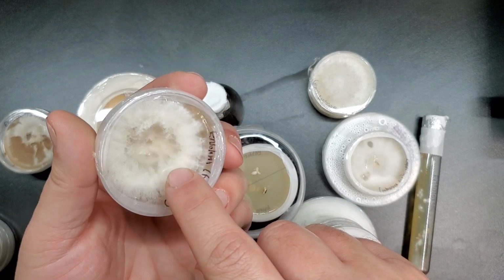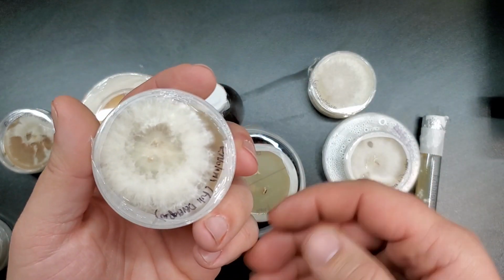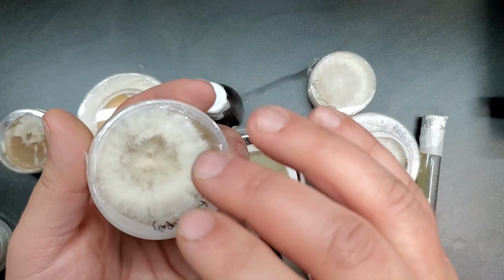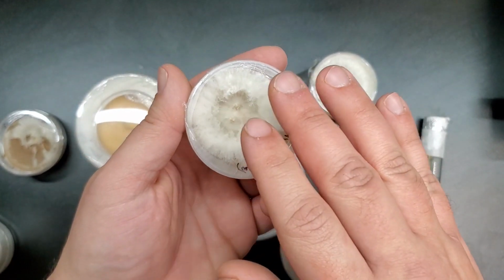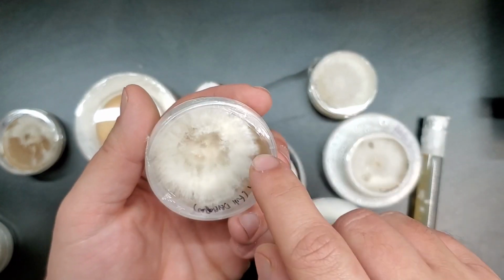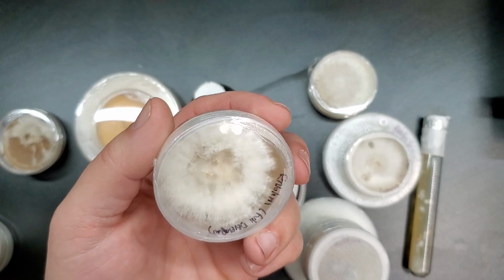And this is one of the original ones too that I inoculated with the mushroom fruit body tissue sample. Looks great. The growth is fantastic. It's actually grown very, very three-dimensionally. Usually mushroom mycelium grows fairly flat along the surface of the agar, but this one grew very, very up, and it actually squished itself against the top of the petri dish, which I just think is pretty neat.